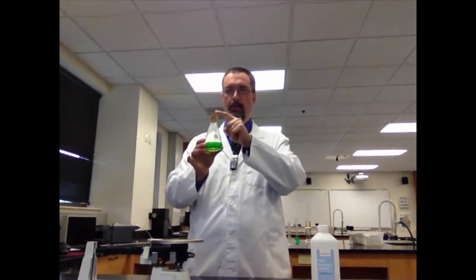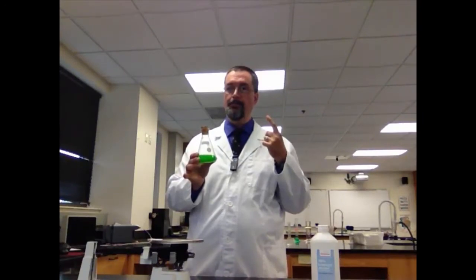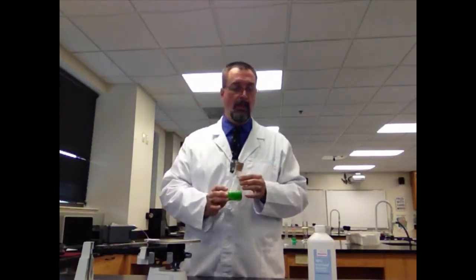You need to be particularly careful when dealing with this particular liquid. When the cork comes out of this bottle, you need to make sure that your goggles are on, and you need to be very careful about getting this on you. If you do get it on your skin, wash it off. And as tasty as this might look, don't drink it. Bad for you.